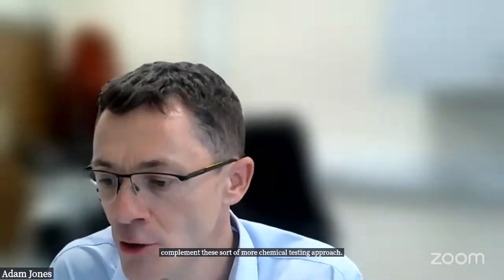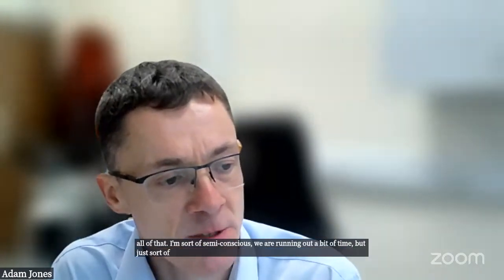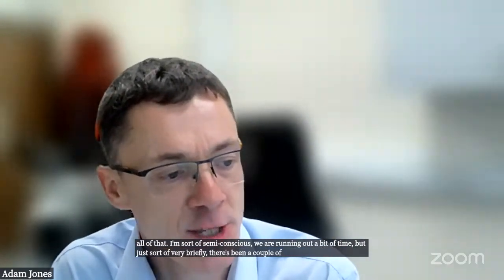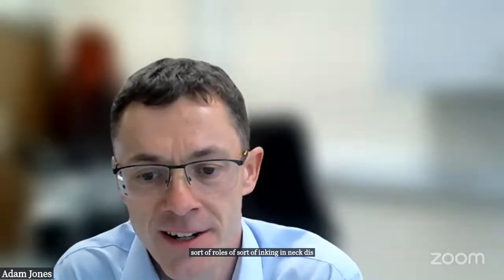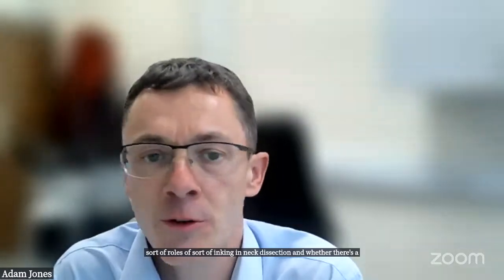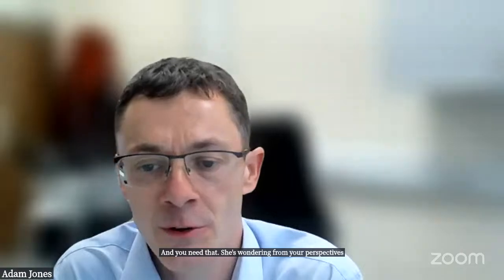I'm semi-conscious we are running out a bit of time, but just very briefly, there's been a couple of questions on neck dissections and the role of inking in neck dissection, and whether there's any need there. I was just wondering from your perspectives what your approach is with regard to that.